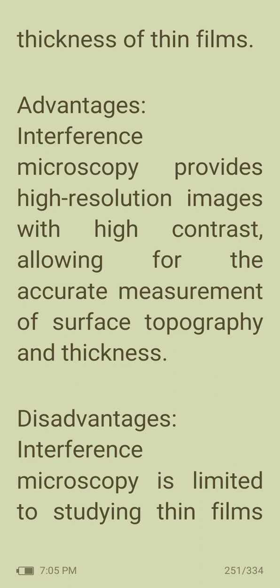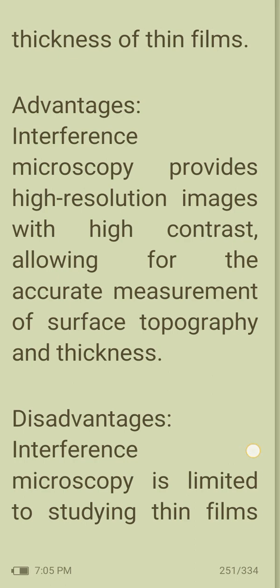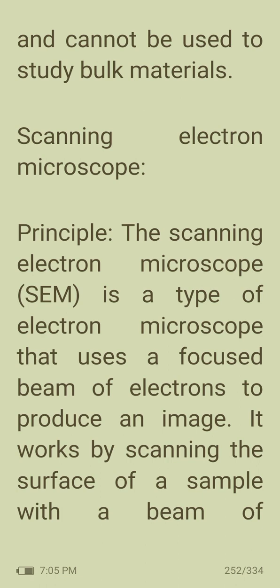Interference microscopy can be used for determining the thickness, and it gives an accurate measurement of surface topography and thickness. What is the disadvantage? Interference microscopy is limited to studying thin films and cannot be used to study bulk materials.